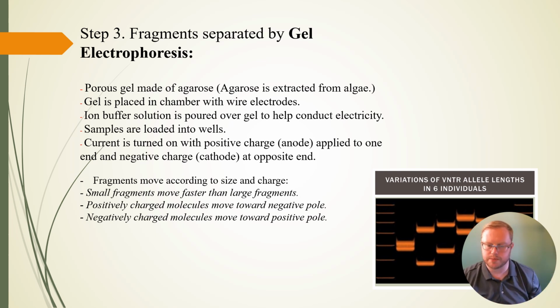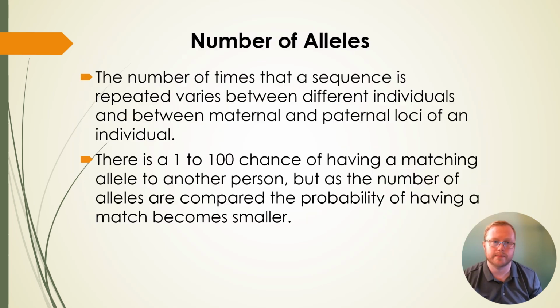And the end result ends up being like this barcode type pattern. So very convenient that this is what DNA does. Very convenient that this is what it looks like on an agarose gel after we run it.